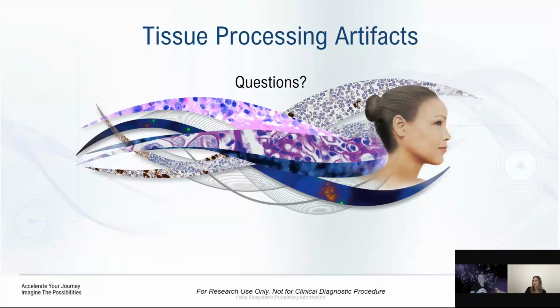All right. Okay, Robin, this next question I have for you asks if this is a problem. Tissue rinsed in PBS and then fixed in formalin. Is it true that the salts block the formalin?